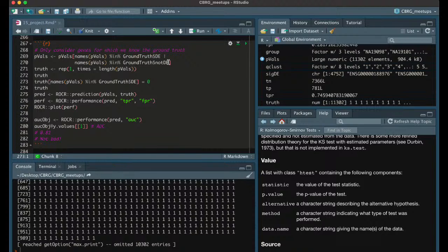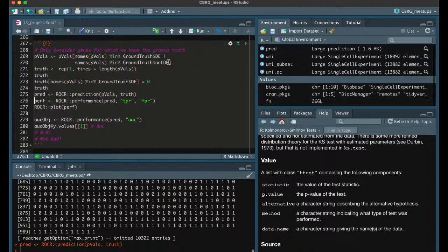And in a lot of these binary classification tasks, that's what you do. You specify some kind of cutoff. Anything below it belongs to class A, anything above it belongs to class B. What you can do is evaluate the performance of your model based on a continuum of cutoffs, which is what we are doing in these lines of code here, which I'm just glossing over.